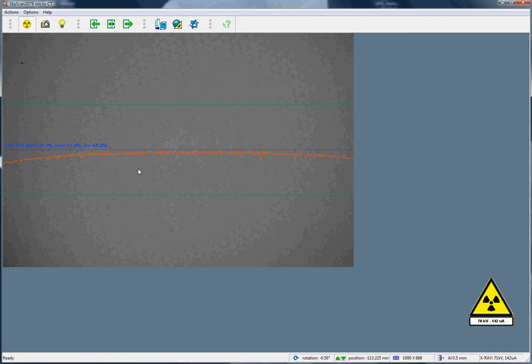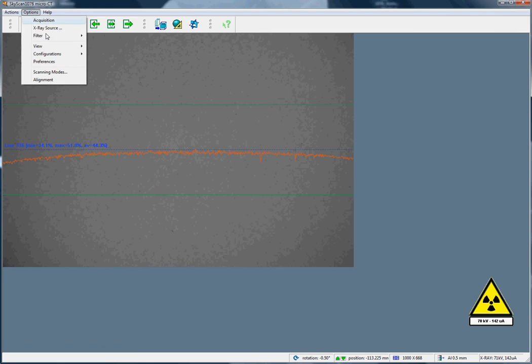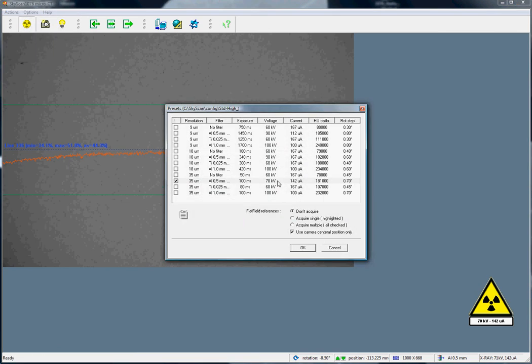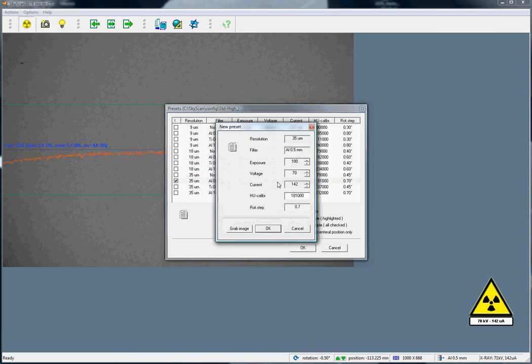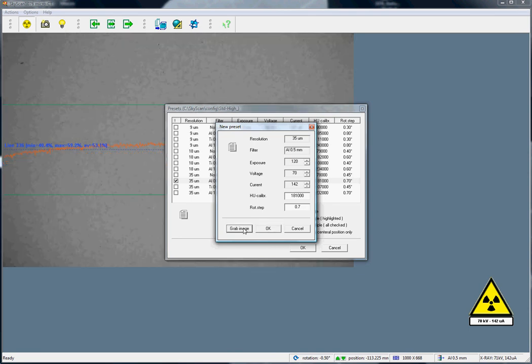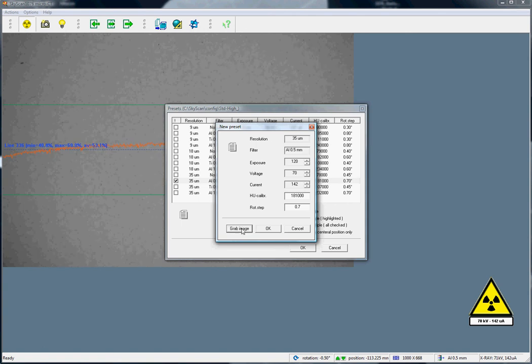So, how do we increase it again to 50%? To do this, we go back into the scanning modes, under options, and we increase the parameter exposure time. Let's increase it from 100 to 120. Now we can grab the image, and we can see that we're back at a level of 53%, which is an acceptable value.